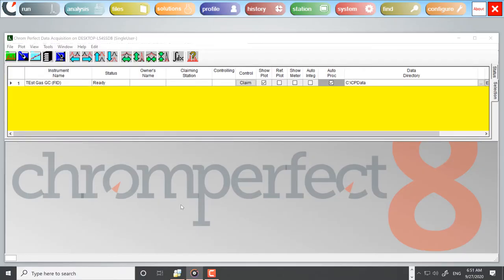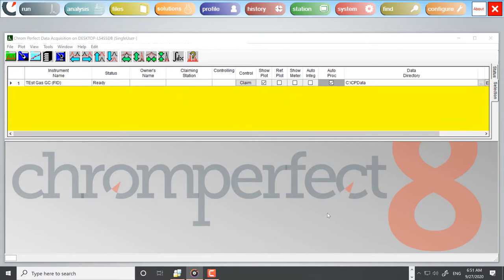This short training video demonstrates how to disable the automatic printing of reports with ChromePerfect. This is important to many users who do not require a hard copy report, or they review their chromatograms and make adjustments before printing a final report.